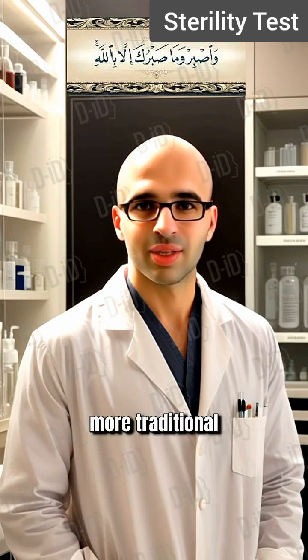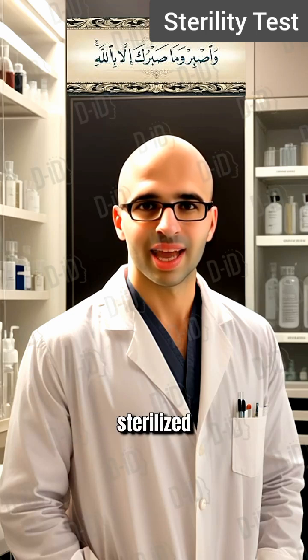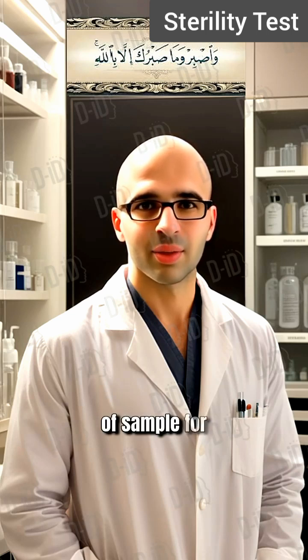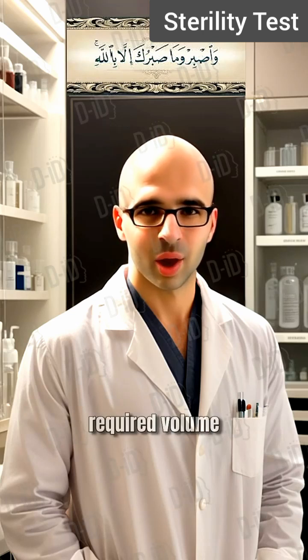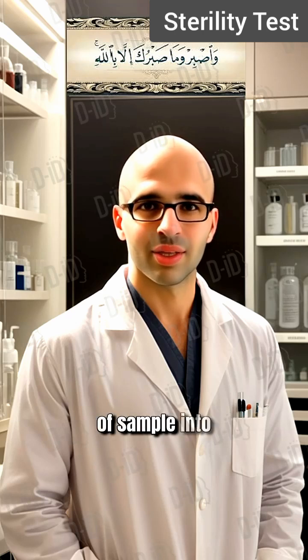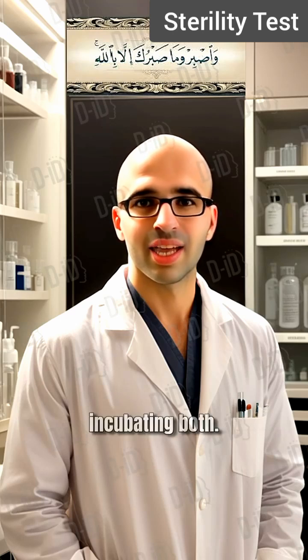Second method is direct inoculation. It is the more traditional sterility test method. Basically, it involves 3 steps. 1. Aseptically opening each sample container from a recently sterilized batch of product. 2. Using a sterile syringe and needle to withdraw the required volume of sample for both media from the container. 3. Injecting one half of the required volume of sample into a test tube containing the required volume of FTM and the other half volume of sample into a second test tube containing the required volume of SCD, and incubating both.